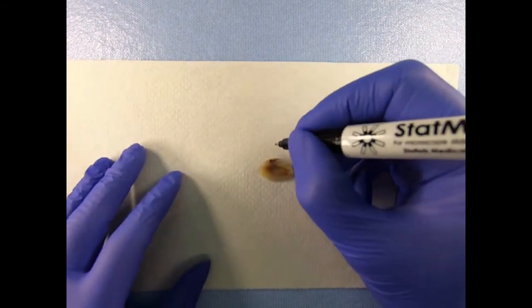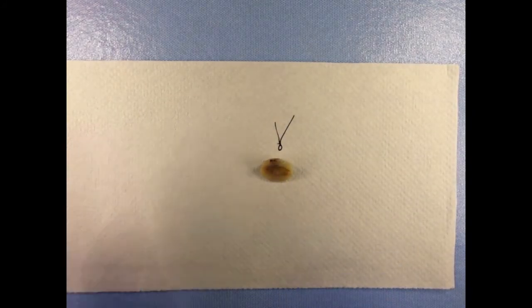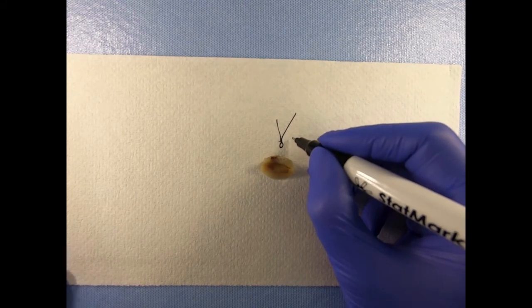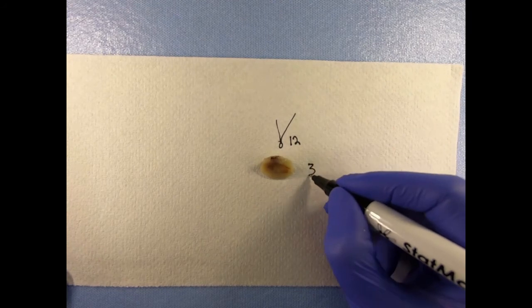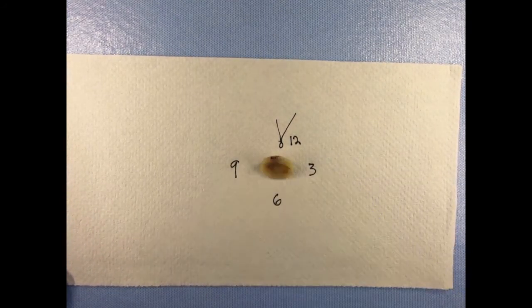They are generally oriented with a single suture or ink designating a specified position such as 12 o'clock or anterior. The clockwork technique utilizes a clock face template to orient specimens that is independent of anatomical orientation, allowing for accurate coordination between the clinical and laboratory settings.